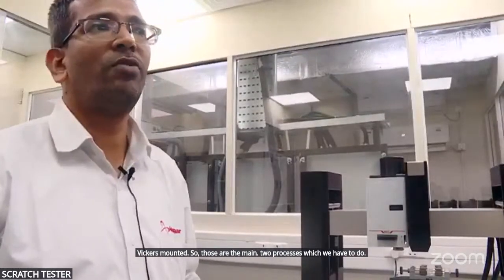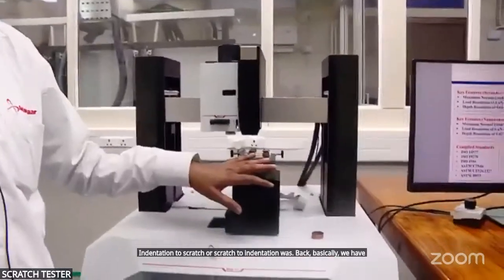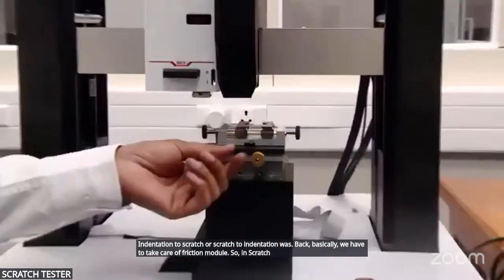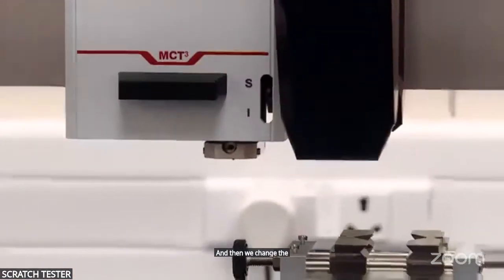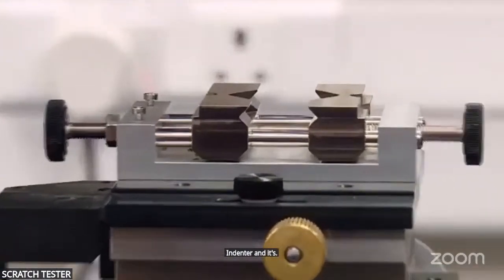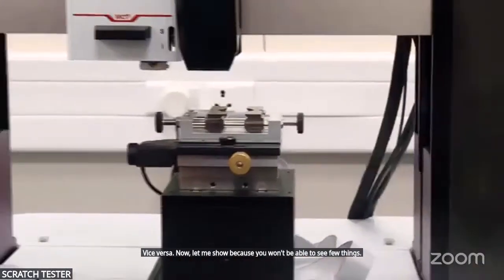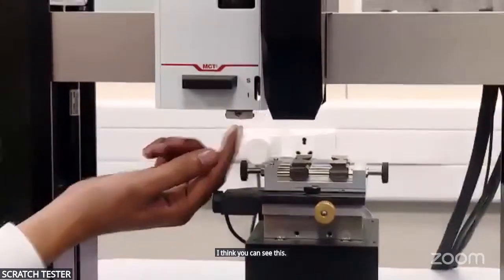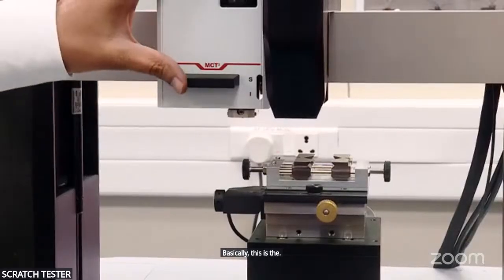Say we are switching from indentation to scratch, or scratch to indentation. Basically we have to take care of the friction module. In scratch it's in work, so we take out the knuckle screw, change the lever to scratch and change our indenter, and it's the opposite when we go the vice versa. Now let me show, because you won't be able to see a few things. I think you can see this part. Basically this is the reference ring.